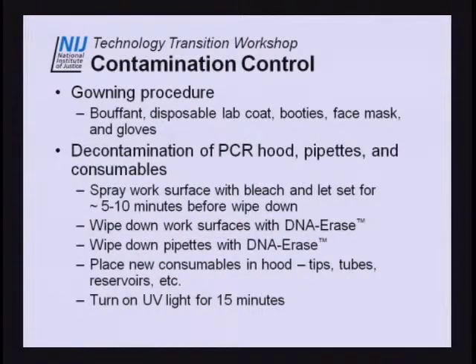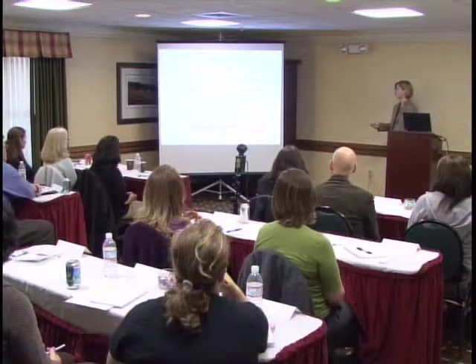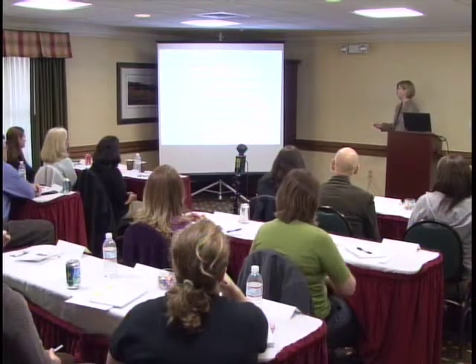So one of our concerns in our lab is obviously contamination control, and as most of you probably do anyway, we control that by gowning procedures and decontamination of our work area. So I will have you guys gown up tomorrow in a lovely blue bouffant, disposable lab coat, booties, face masks, and gloves, and I even have safety glasses for you guys.